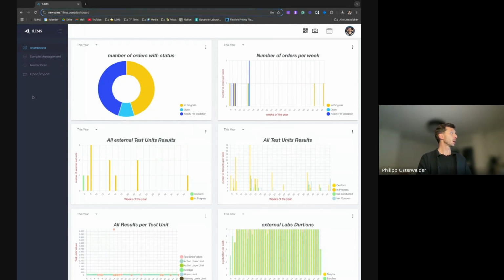To start very quickly, we are here in the master data. We have all the important information directly here if we don't have any kind of interfaces or integrations. So we can handle directly all the basic information which the lab is using and built on directly in OneLIMS: contacts, articles, article data, test methods, and then create test plans.